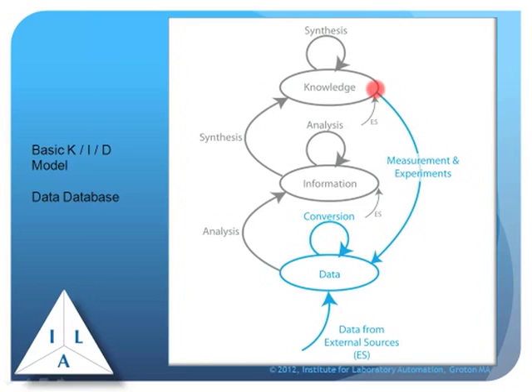So the information that the analyst needs to work with comes out of this database. All the work that gets done on the lab bench goes here, and the resulting information winds up in another database. If you're doing a laboratory system that existed, say, in the 1960s, that database would be your notebook. Today, it's computer systems.